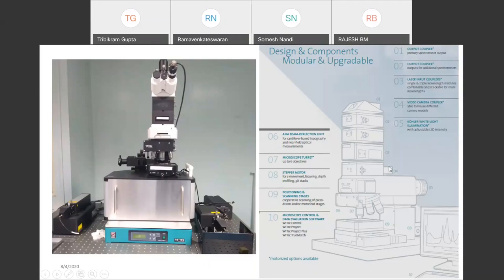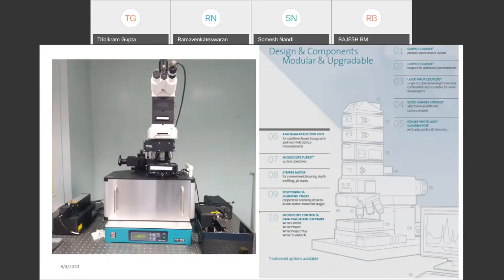Number four is the video camera coupler so the microscope can be focused. Number five is white light illumination, which can be focused on the sample so it is properly focused before allowing the laser light to fall on it. Number seven is the microscope turret with different magnifying lenses: 10x, 20x, 40x, 50x, for magnifying images of the sample surface. There is a piezoelectric scanning stage that allows us to align the sample and move along the three axes — X, Y, and Z. This is the sample stage with a stepper motor attached, which can be moved along the three axes using a remote.